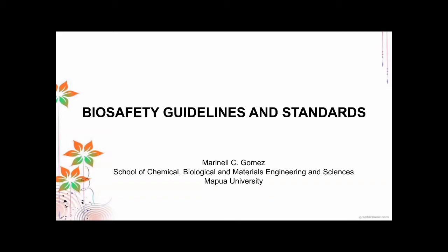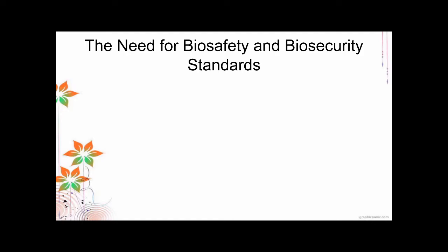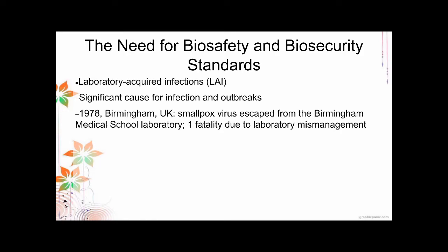Today we will be discussing biosafety guidelines and standards. So why do we need biosafety and biosecurity standards? Basically, one of the main reasons why we need to implement these standards is to prevent laboratory-acquired infections. LAIs, or laboratory-acquired infections, are a significant cause of infections and outbreaks.